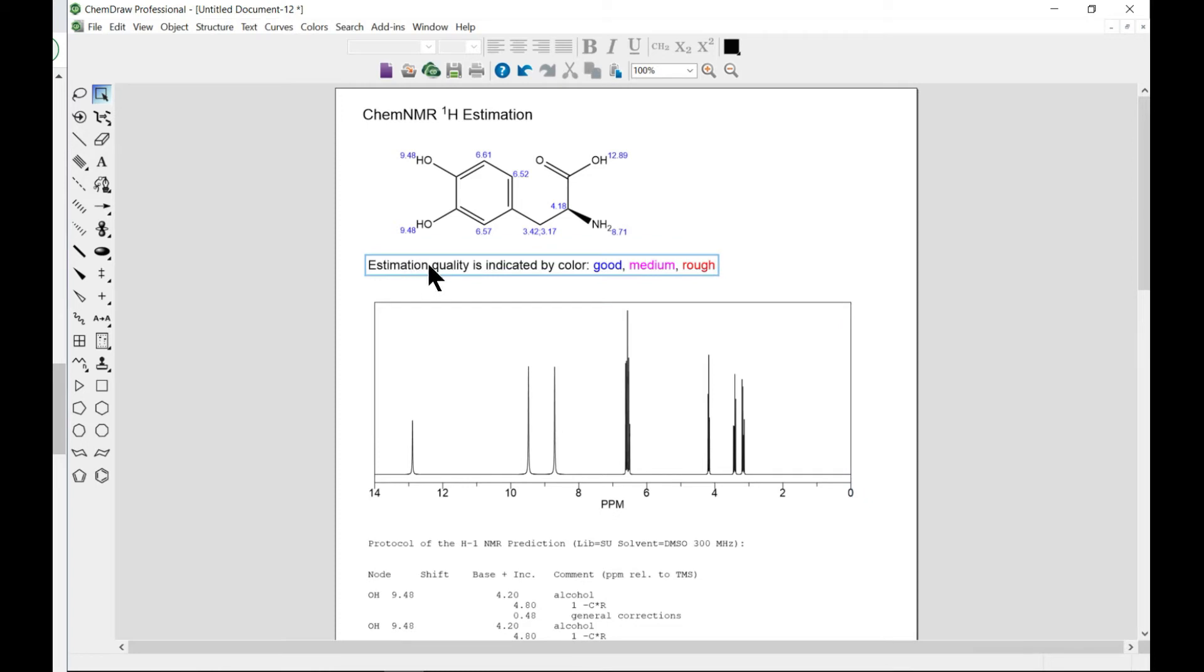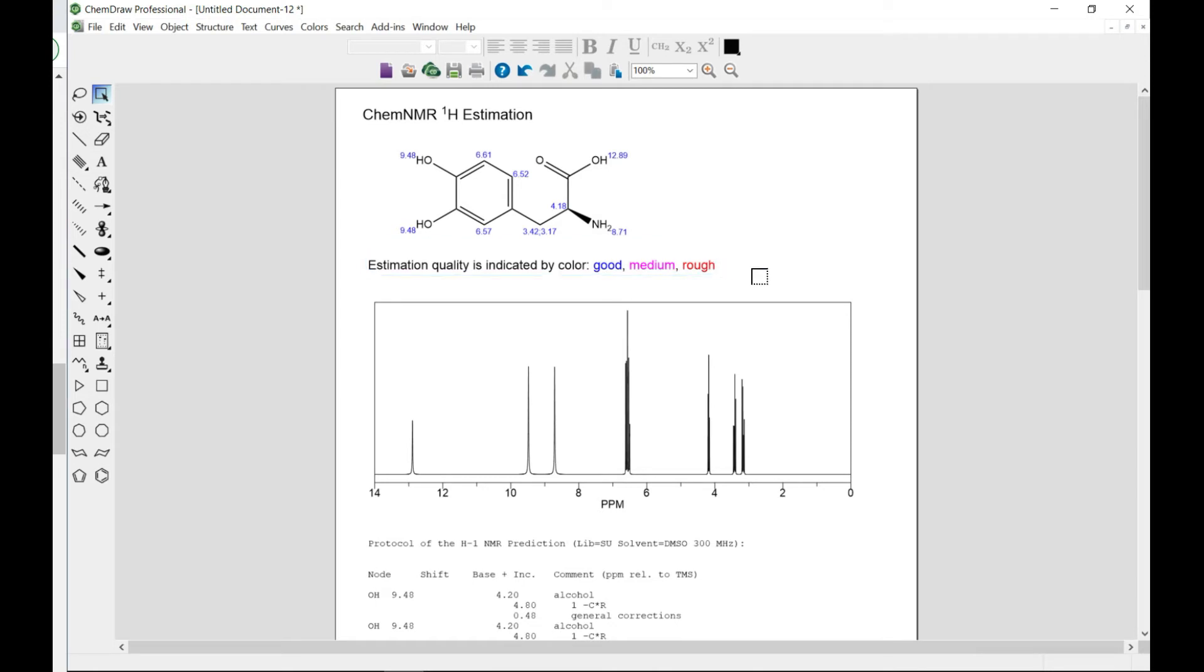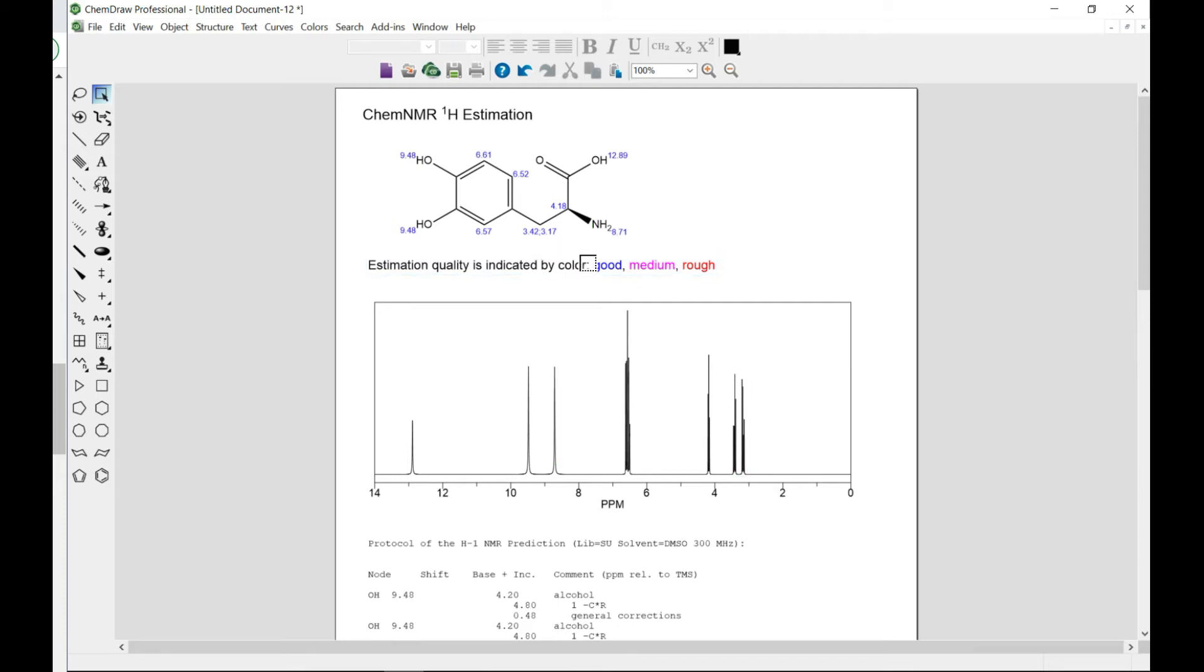So it says the estimation quality indicated if it's blue, it means it's good or rough or whatever. So that is basically how you do it.